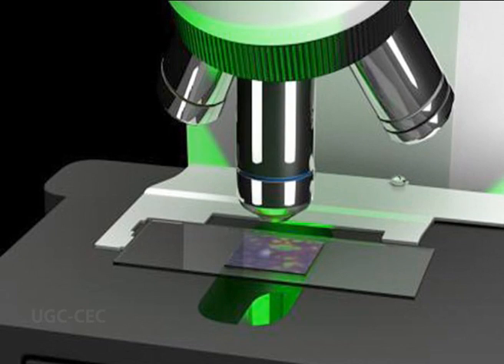Hello friends, today I am going to discuss staining techniques of plant and animal cells. Staining is an auxiliary technique used in microscopy to enhance contrast in the microscopic image. Stains or dyes are frequently used in biology and medicine to highlight structures in biological tissues for viewing, often with the aid of different microscopes.